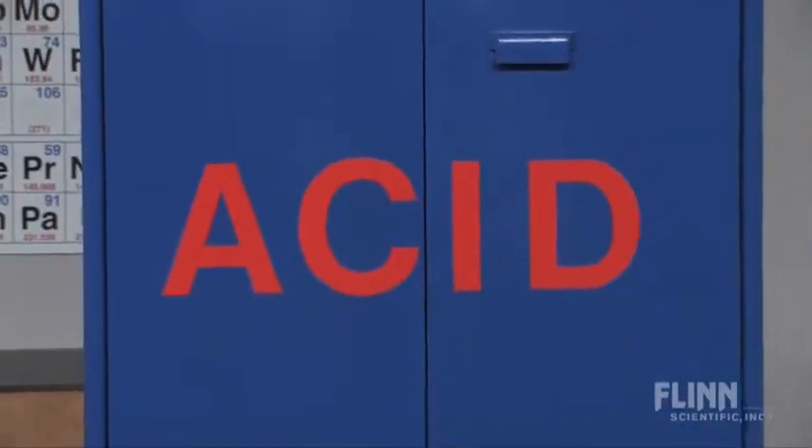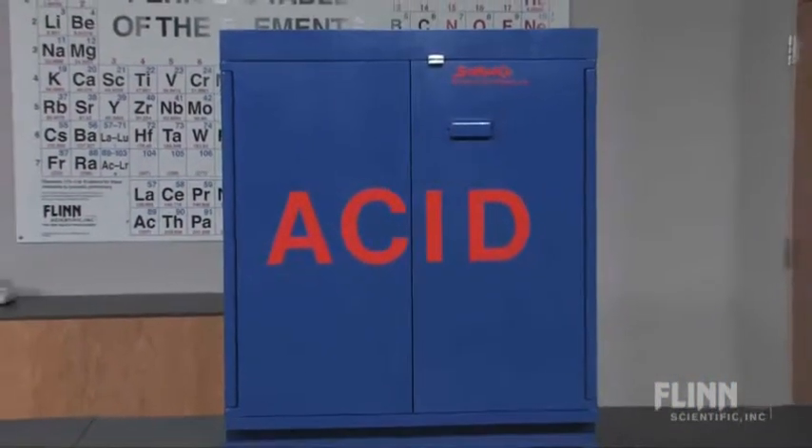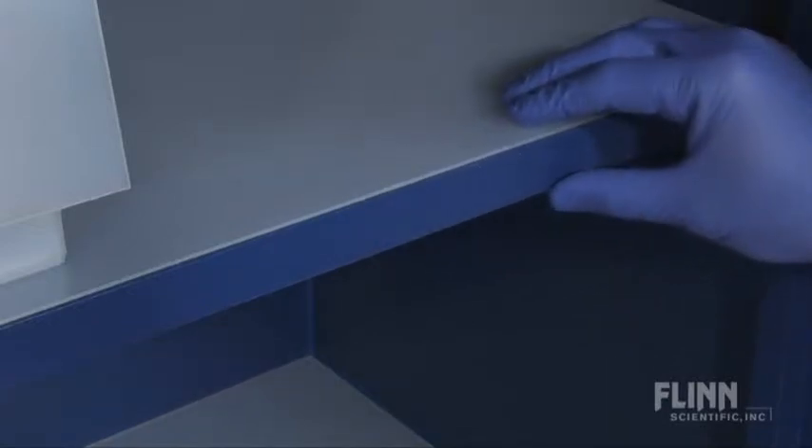Now look at the wooden Flint acid cabinet. No metal components are used in the manufacture of Flint acid cabinets. All Flint cabinets are constructed of high-quality, one-inch, exterior-grade, multi-ply plywood to prevent corrosion and guarantee years of safe acid storage.